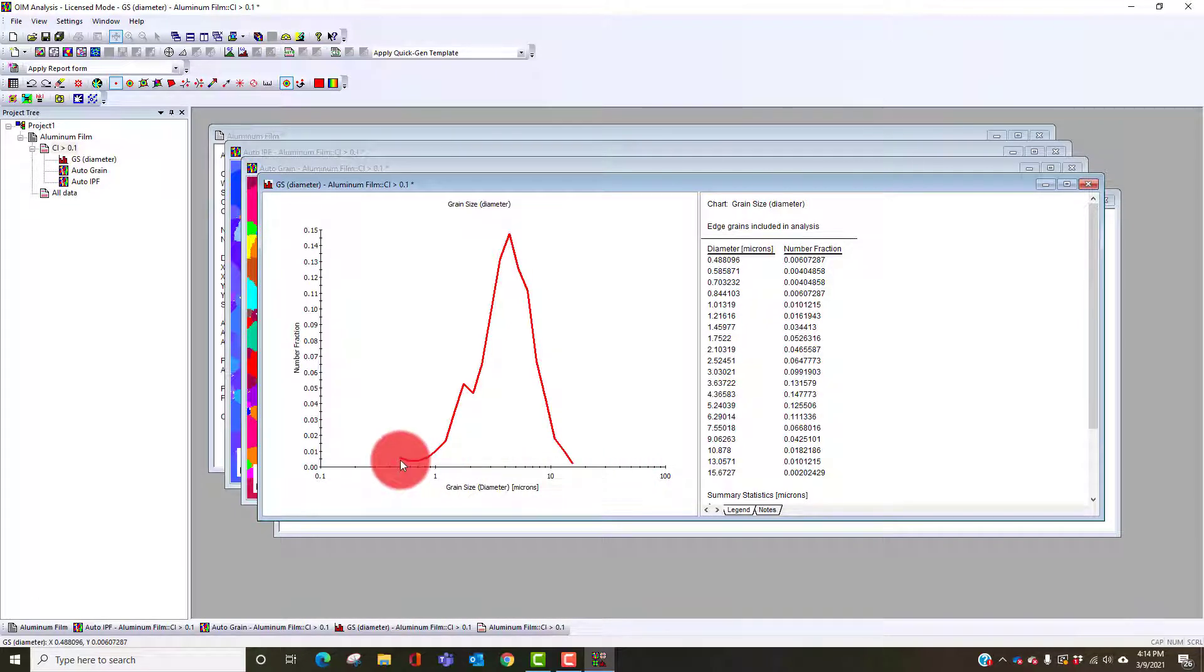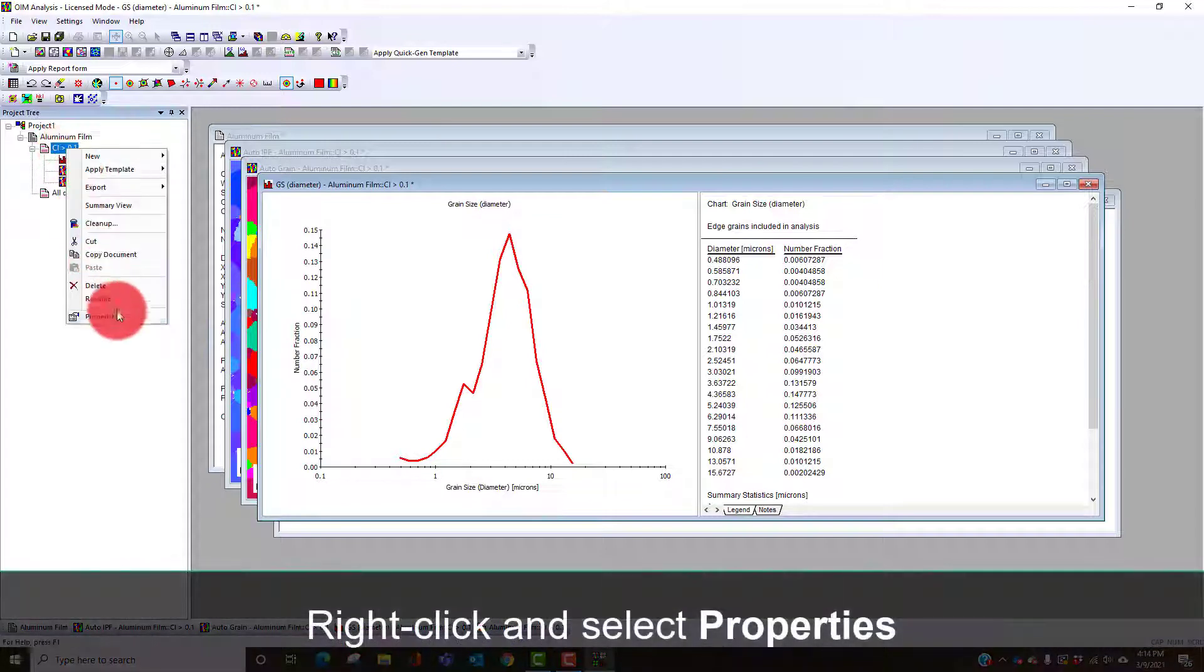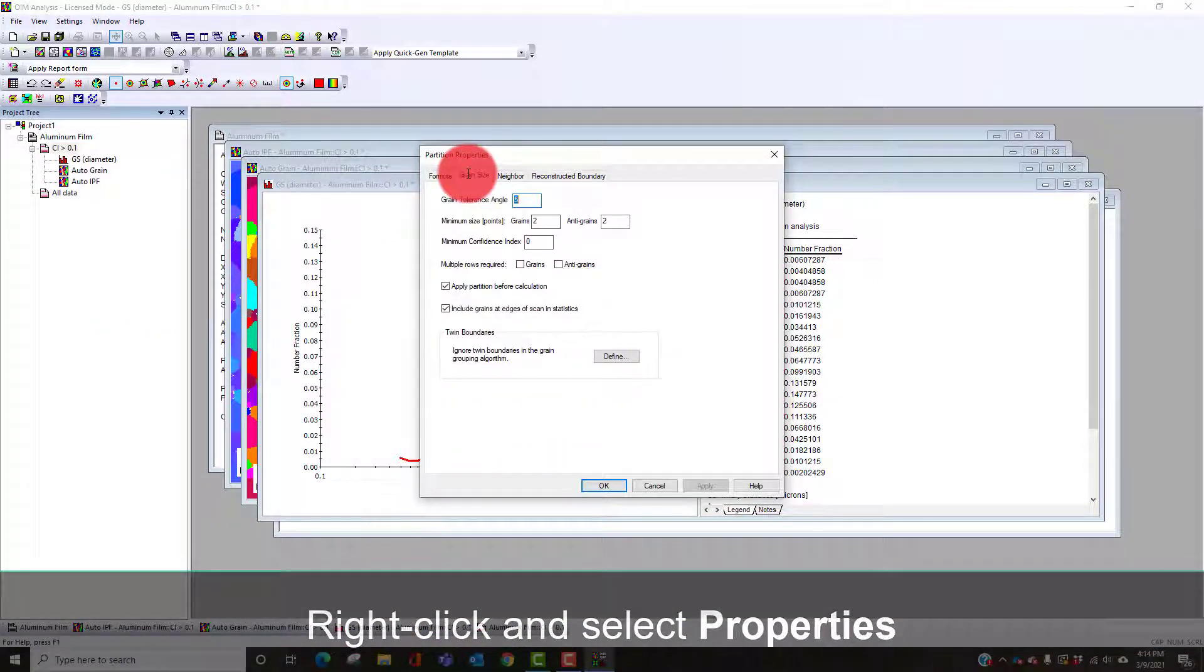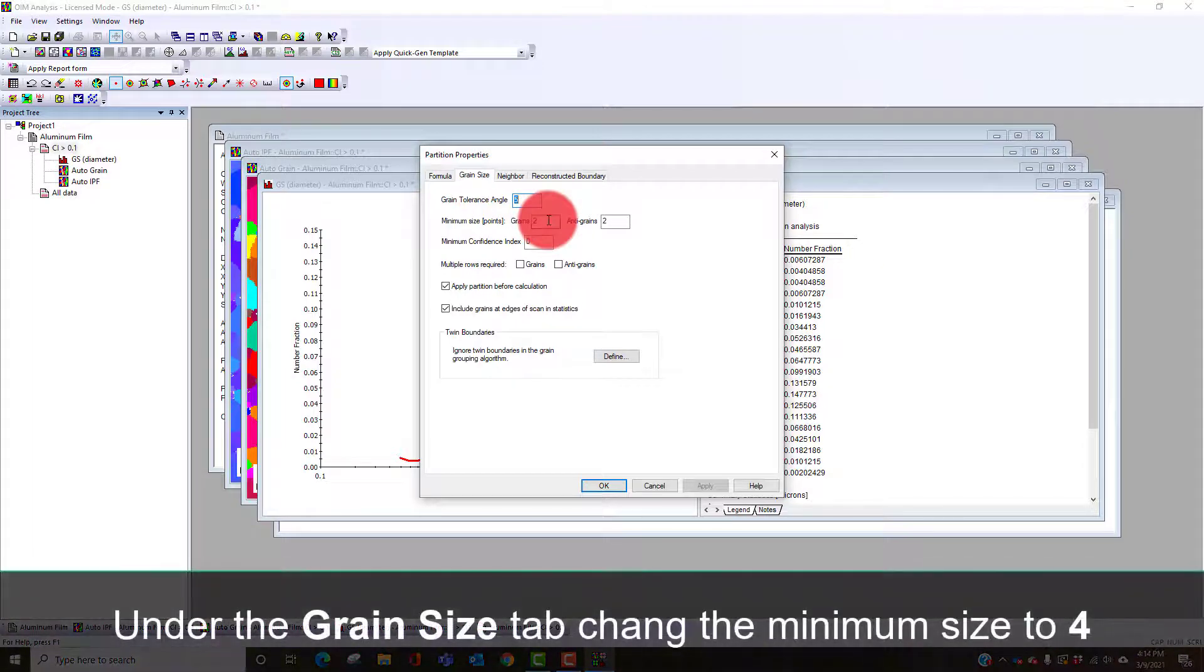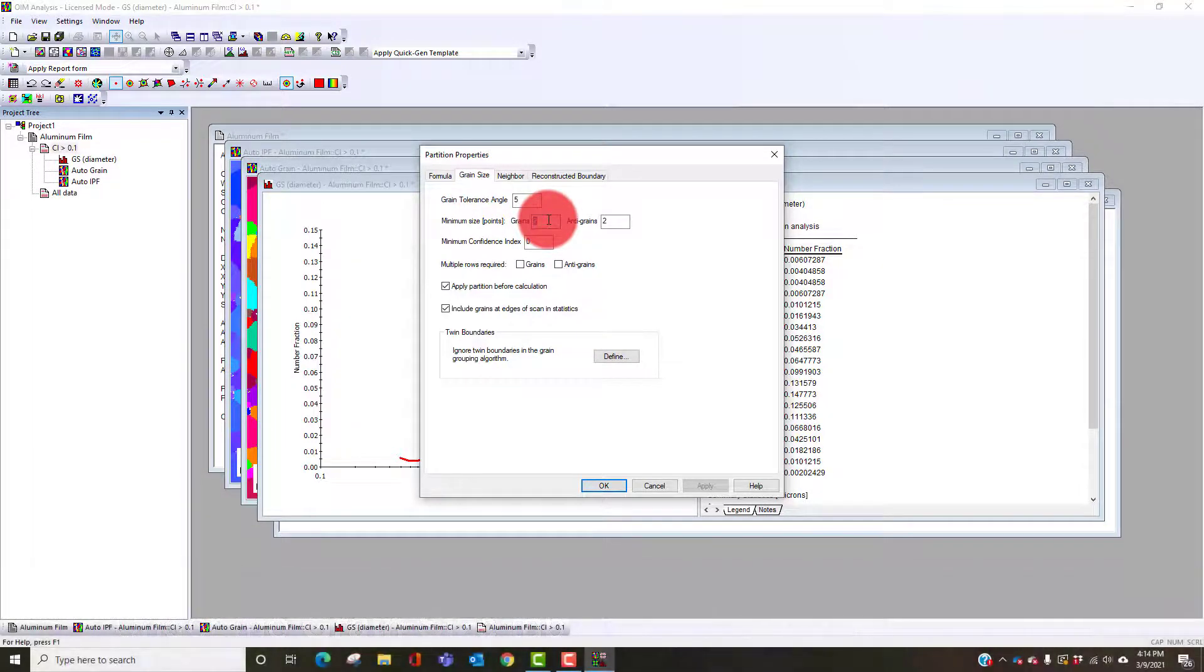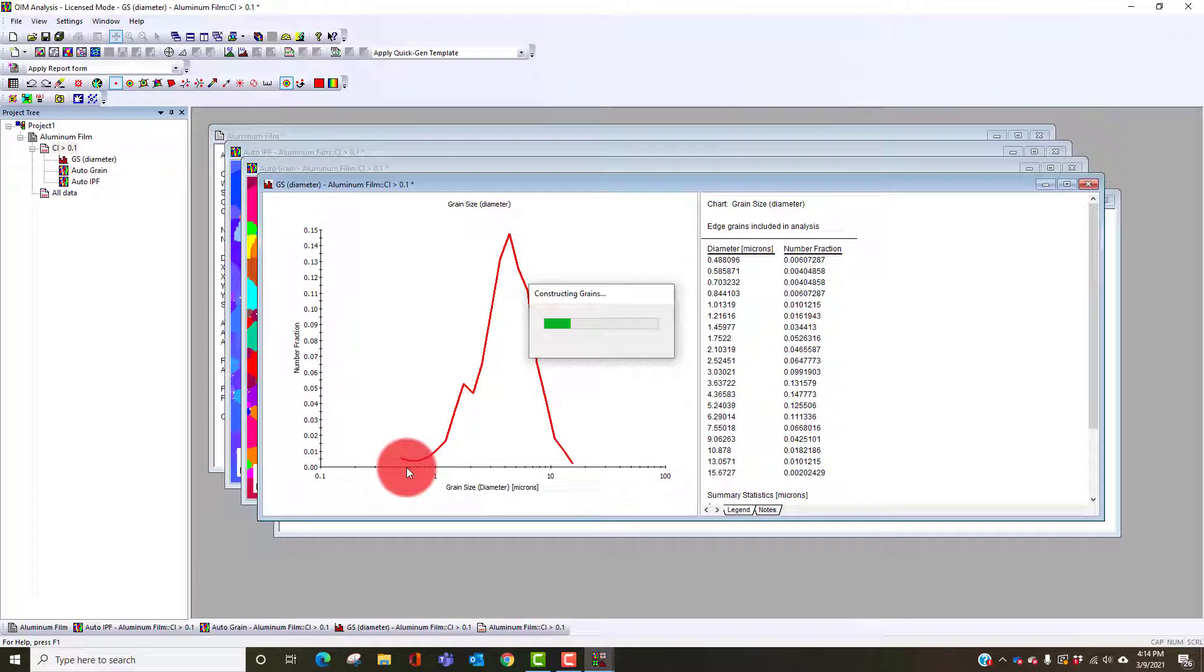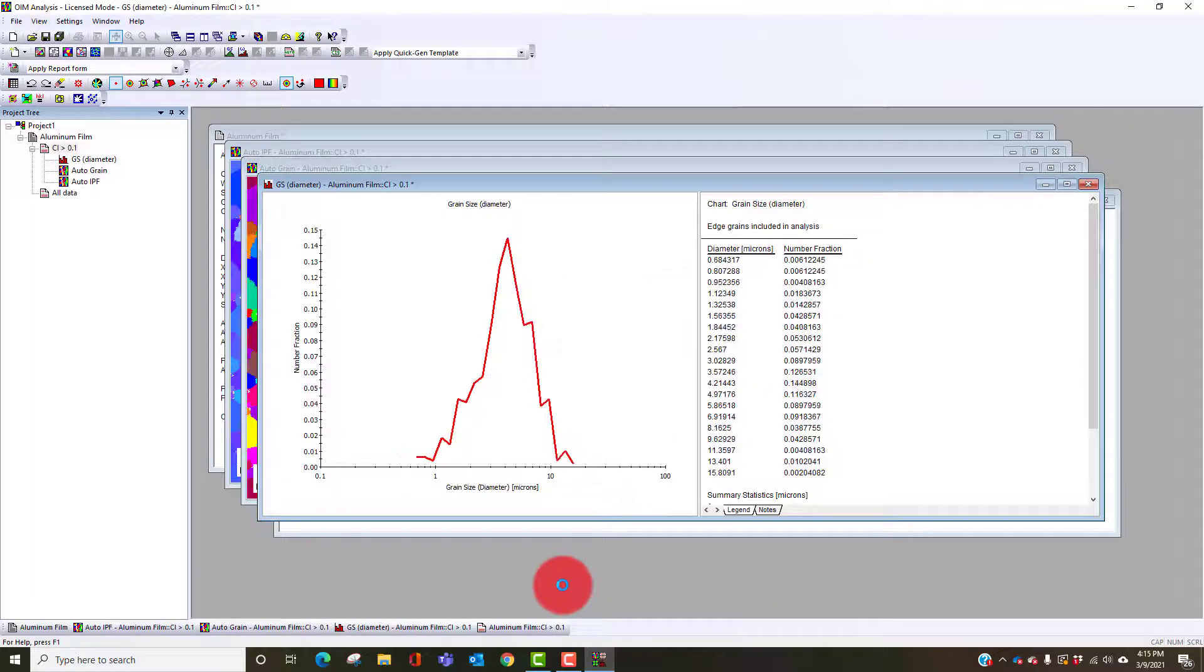We can adjust the minimum number of pixels required for a grain. In this case the minimum is two. We have to have at least two pixels of the same orientation within five degrees. I'll set that to four. It'll recalculate and maybe that tweaks the tail just a little bit. So there's a little change in the distribution.